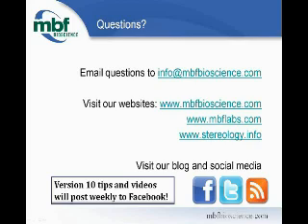Patrick Schwab asked, do you as well take care of the coordinates of Zeiss LSM or Olympus OIF if you mosaic images? Yes, we read the scaling. We read whatever information is accessible to us in those files, and we'll place it into our coordinate space appropriately. We're asked if Biolucida is a hardware solution. Actually, Biolucida is pure software. It is meant to be a method for containing all of your image data. If you want, you can also get a specific Biolucida server, which will work together with the Biolucida application software so that we provide a complete solution.